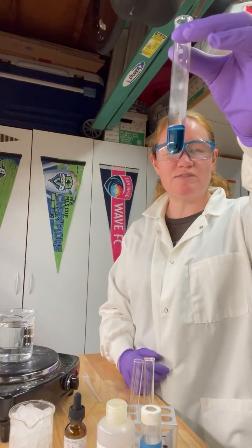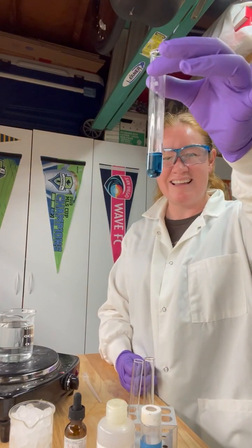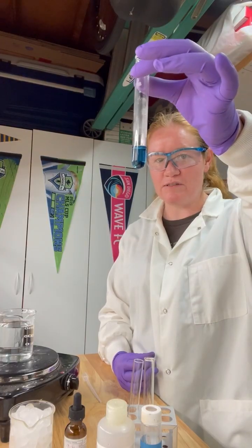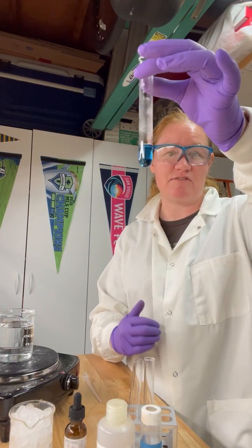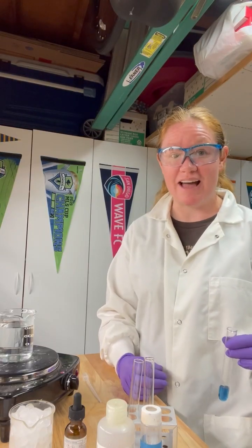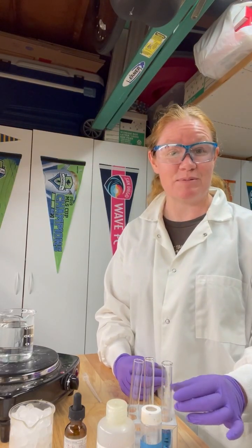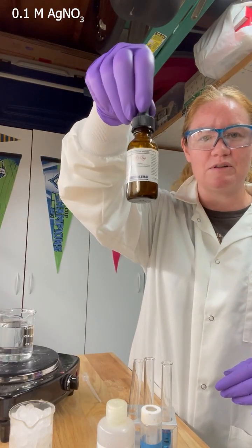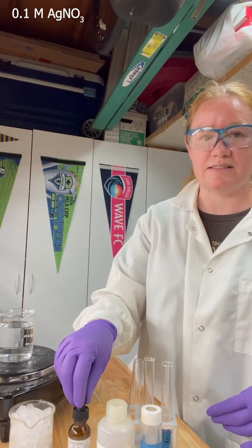Well, how am I going to shift it back toward the reactant side? I need to add something that is either going to flood my system with so much product that it has to shift back to reactants, or I need to do something where I remove one of the reactants from the system to get it to produce more. So I'm going to do the latter. I'm going to add 0.1 molar silver nitrate to my system.